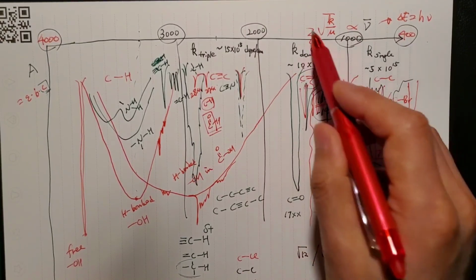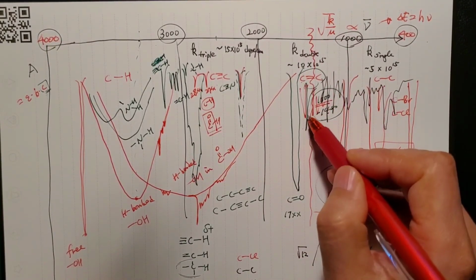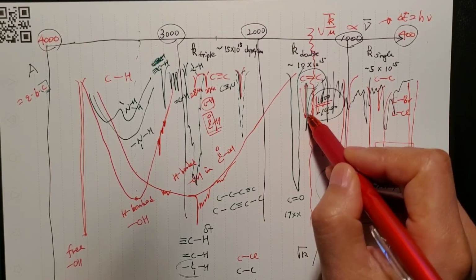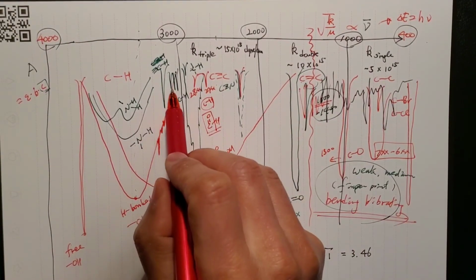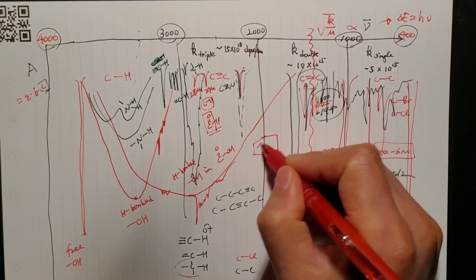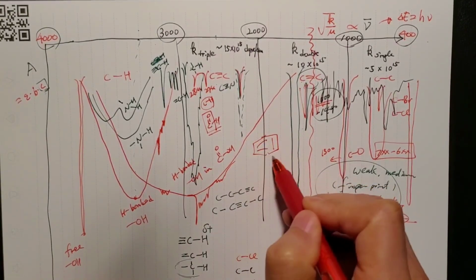Then it's overtone and bending vibration and you want to trust it, but it's too close. But there are multiple of them. Then you check it here. Oh, I have several of them. Then you actually have an aromatic ring with many hydrogens.